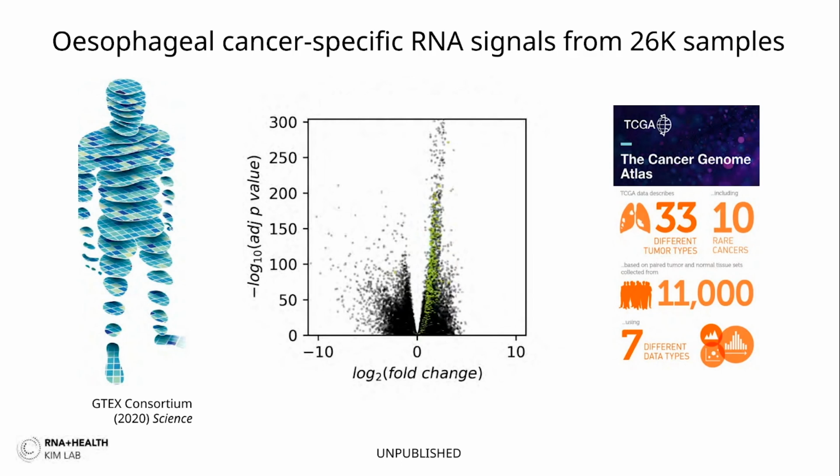And so what we're really excited about is that when we're doing these tissue-specific profiling experiments and we're quantifying all of these libraries using our repeat-aware approach, now we're able to deconvolve the signal to be able to say these RNAs are coming from these specific tissue types or these specific disease types.